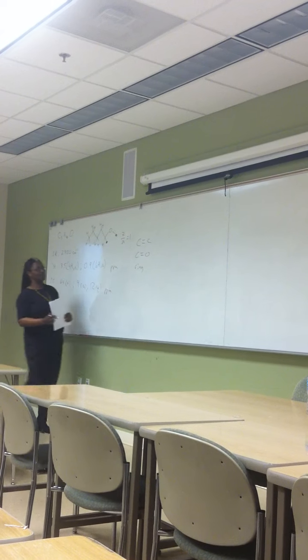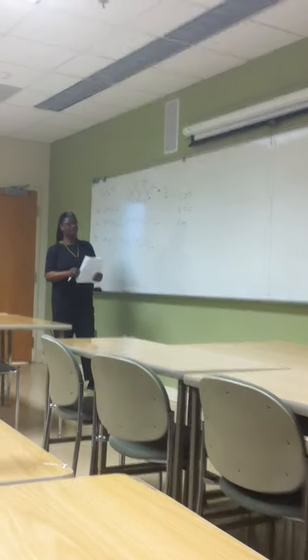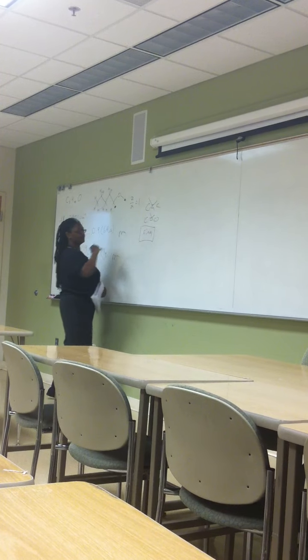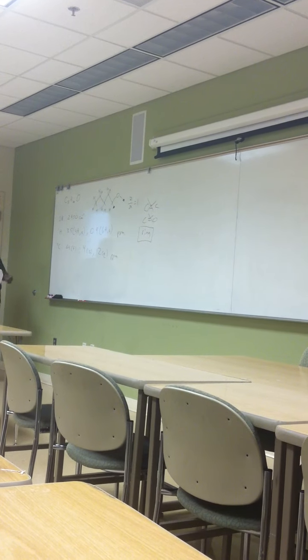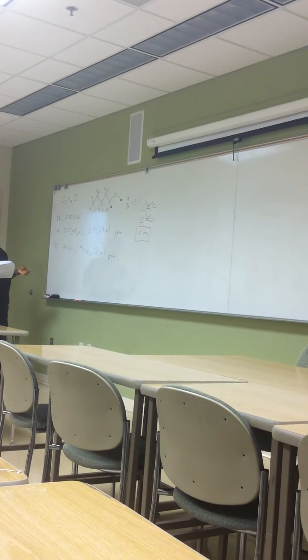So that means you're not going to have these. You don't have anything at, for carbon-carbon double bond, like 1680, or carbonyl at 1700. So that means you're going to have a ring. Okay? And so now you can figure out, well, what is this 2950 there? What does that correspond to?